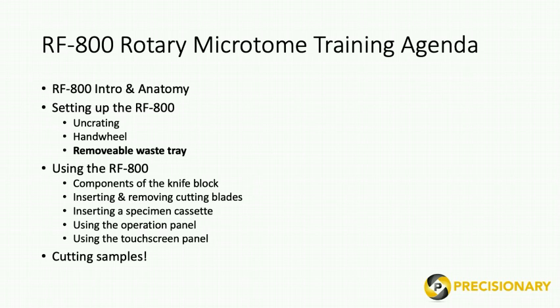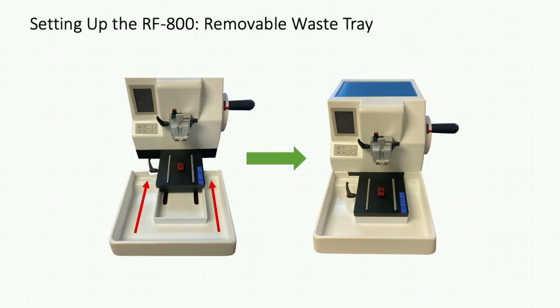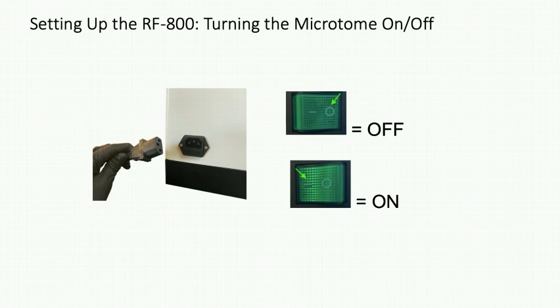Now, let me show you how to install and remove the waste tray. The waste tray will come detached from the main microtome unit. After unpacking the tray, simply slide it under the microtome in front. The tray will fit securely in place. To make sure it is inserted correctly, try pushing the tray in while at eye level with the tray. Power your rotary microtome by simply plugging in the power cord to a safe outlet. Then turn the switch on or off.